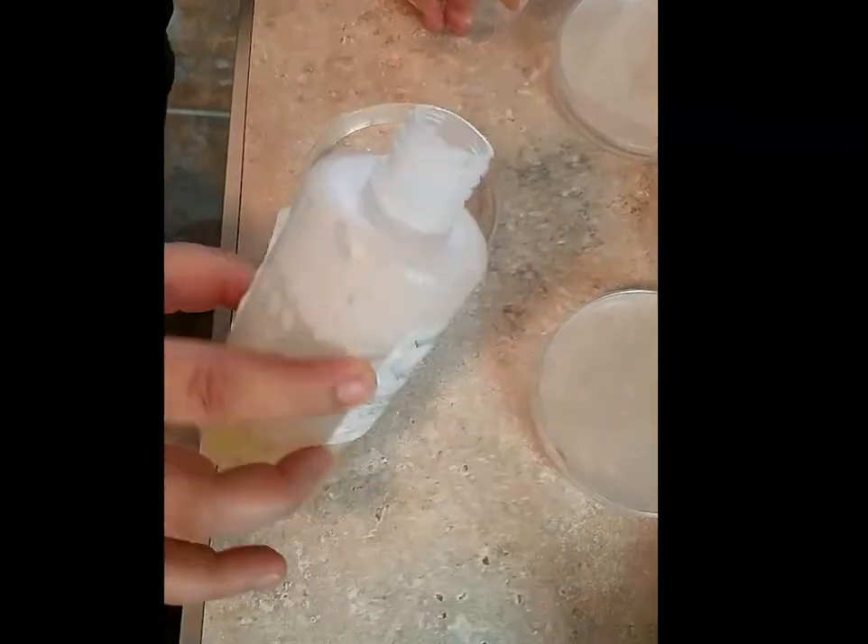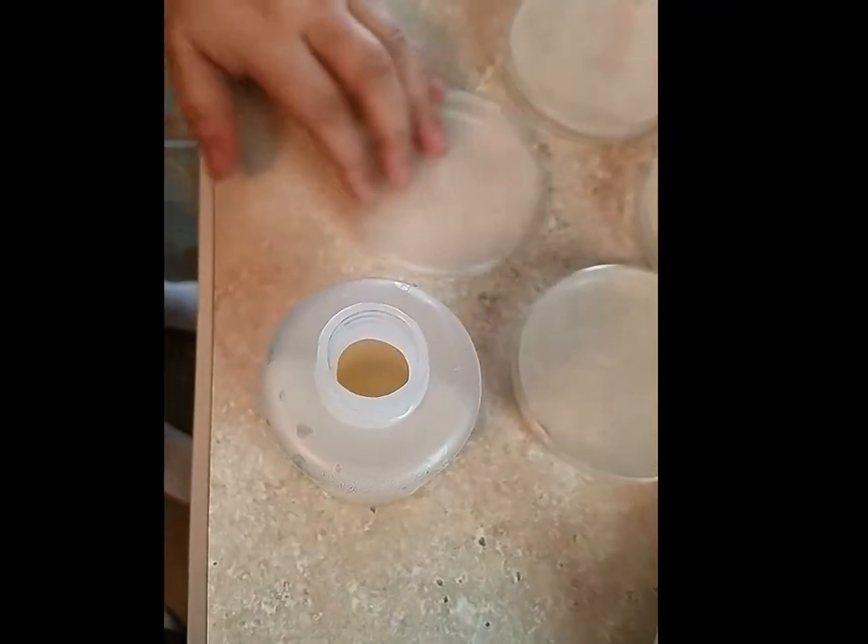Then you can store these, like I said, in a Ziploc or Gladware container — just something that's sealable. You can store them in the fridge.